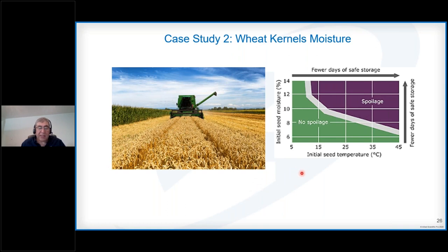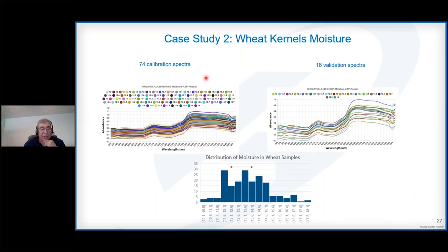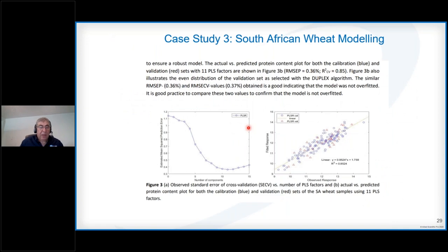The other parameter of interest is moisture. The reason moisture is of interest in wheat is because increasing moisture and temperature increases the probability of spoilage. So for storing conditions, farmers need to know the moisture content of the wheat. We also did PLS modeling with 74 calibration spectra and 18 validation. I'm not showing the preprocessing part here. Again, here's the distribution of our data. We got a relatively good RMSE of 0.34. As I said, the cloud can make predictions, and you can also export the predicted values when you use the cloud.